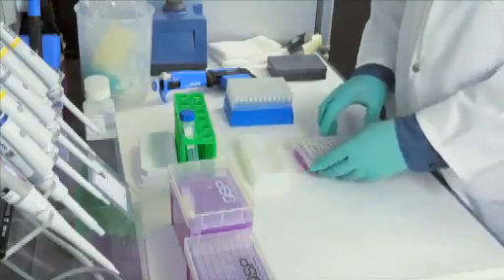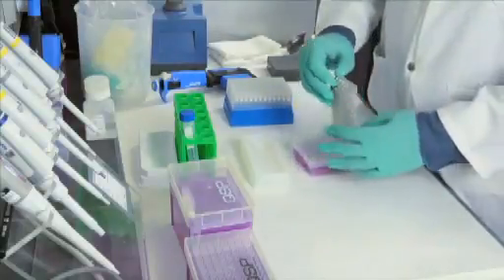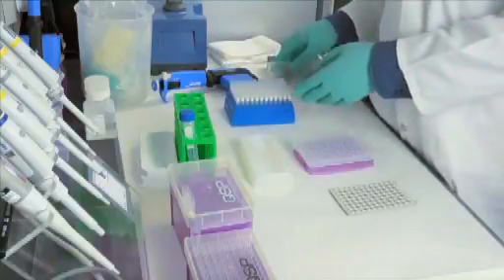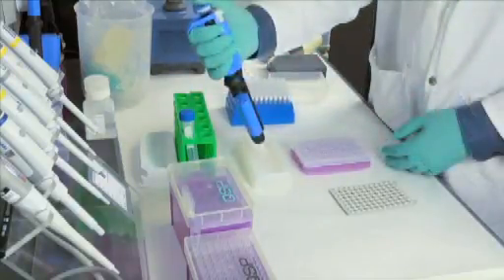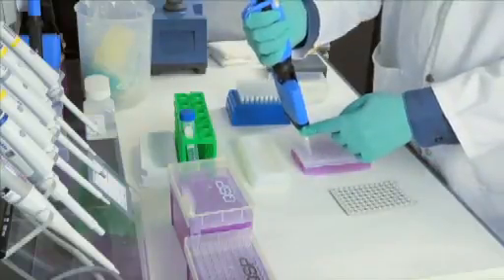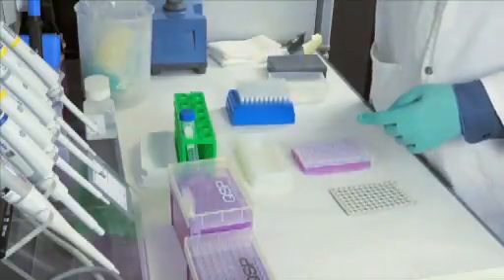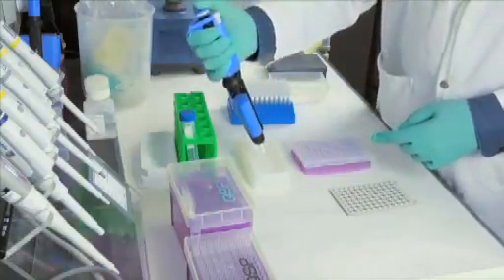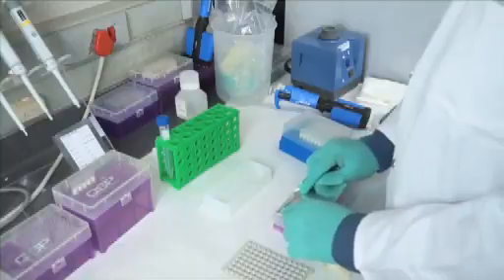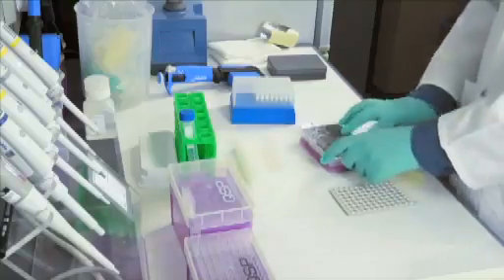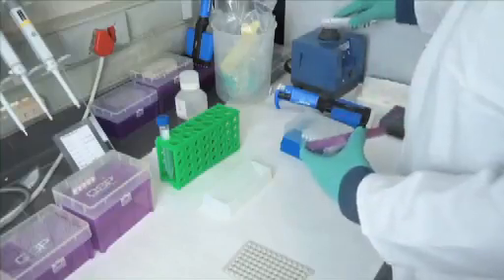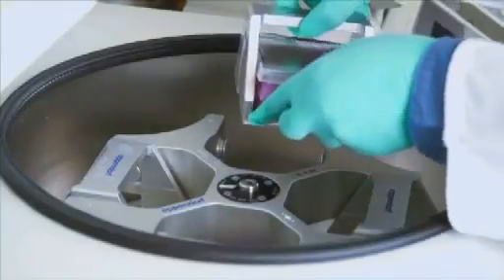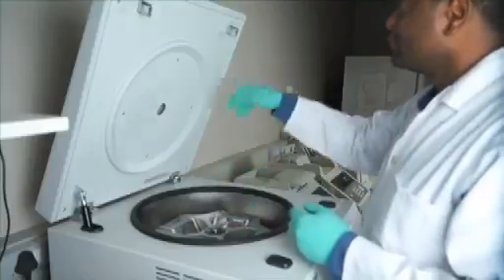For each sequencing reaction, mix 50 microliters of absolute ethanol and 5 microliters of 3 molar sodium acetate. Using a multi-channel pipette, add 55 microliters of sodium acetate ethanol solution to each well. Seal wells with adhesive foil ensuring that each well is sealed properly and vortex to mix. Centrifuge at 3000 RCF for 20 minutes.